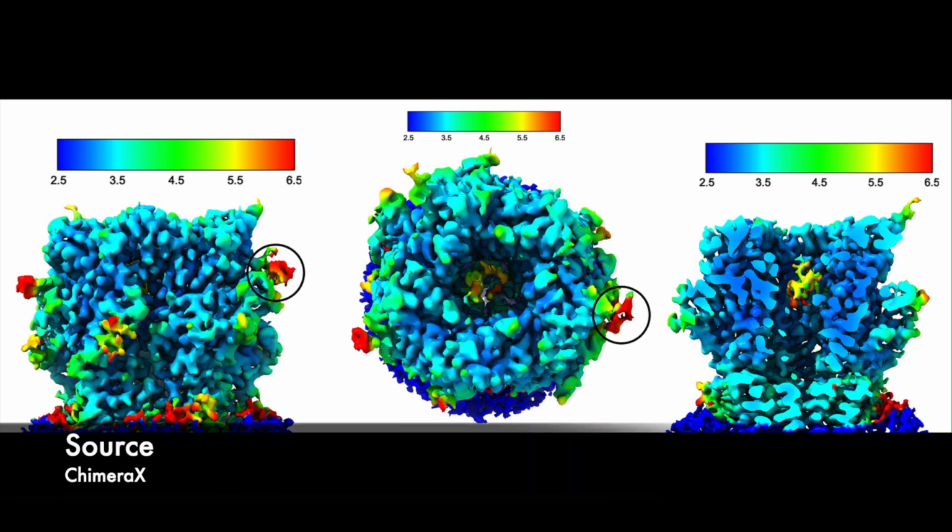We're looking at this, which has a resolution of roughly 2.94 angstroms, so a little bit lower. But what you can see is that the local resolution looks a decent bit better. Circled in black there is the toxin, and it isn't really super well resolved.